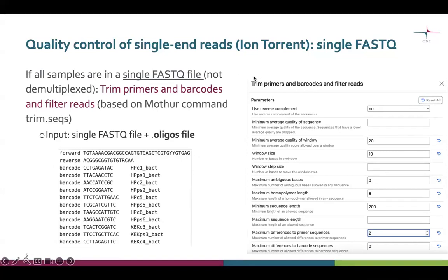Here is a view of the parameter window for this tool. We have settings for the quality scores, for removing ambiguous bases and homopolymers, and for sequence length. We can also define how many mismatches we want to allow against primers and barcodes.